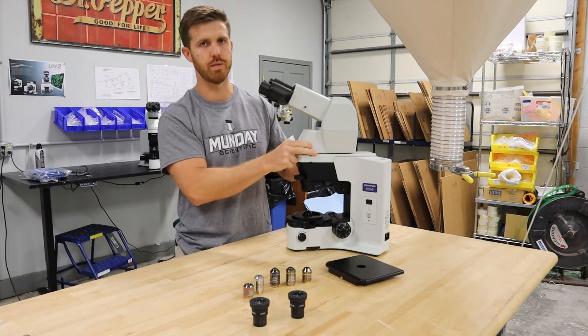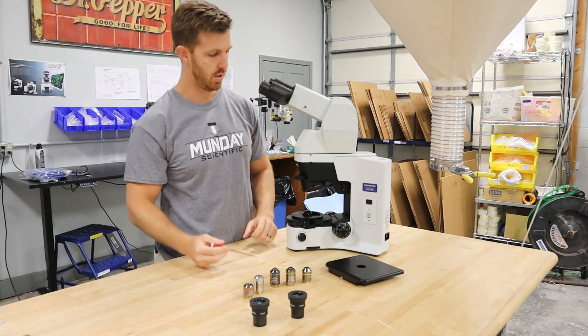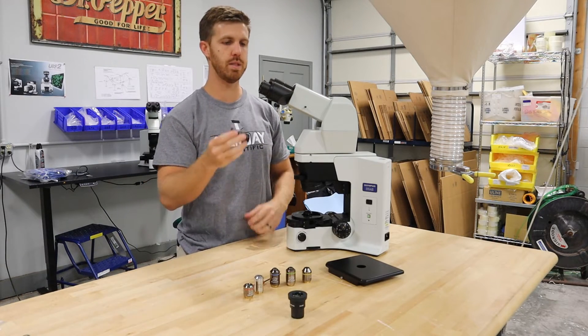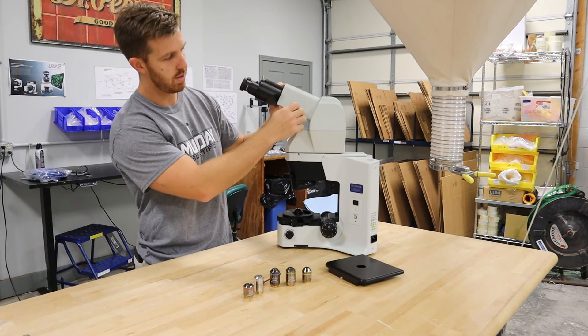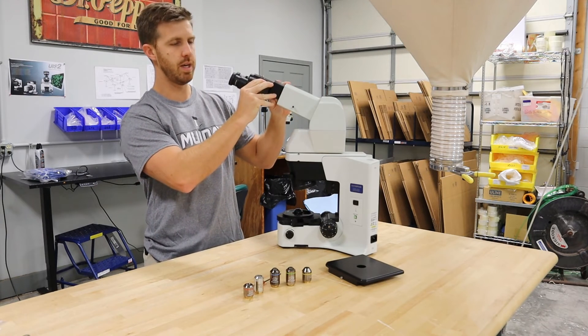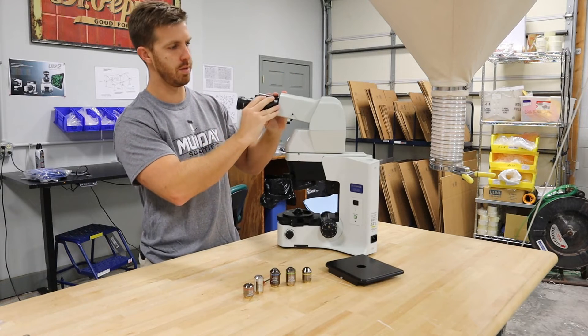It could fall off if it's not down tight, so always give it a little wiggle to make sure it's on there good and snug. Then we're going to move on to the eyepieces — just put them right in. This head is pretty interesting: it has a thumb screw so you can telescope the head out or in for ergonomics, and it tilts up and down as well.